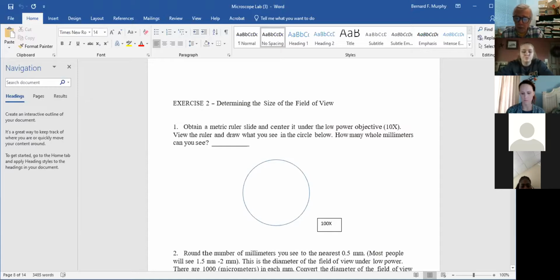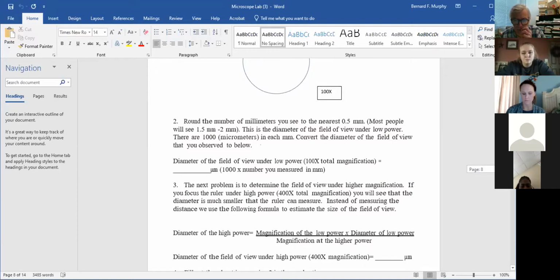So that's 2 millimeters. But the problem is, millimeter is too big of a unit. It's a really small unit as far as, you know, your eye is concerned. But in the microscope, it's a huge unit. So we have to divide it into 1,000 into what's called micrometers.